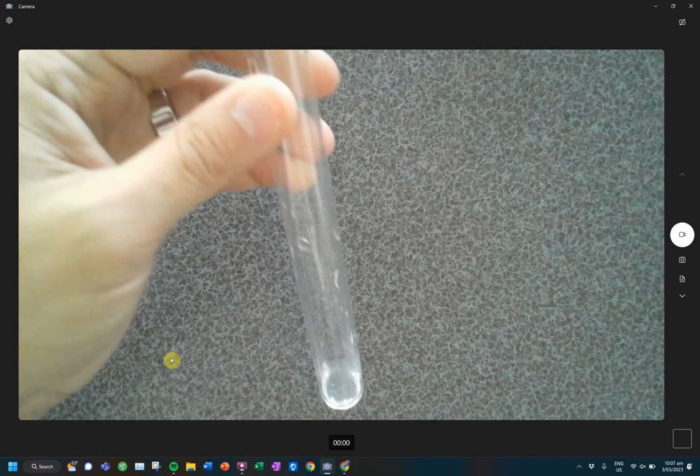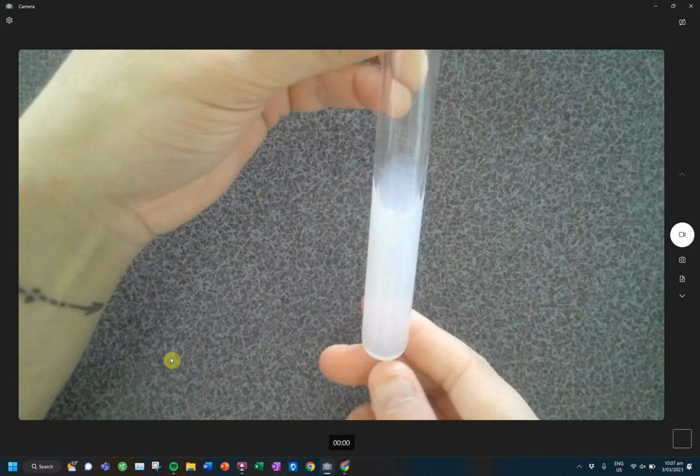And then what I would do is I would add excess of my ammonia. Oh, making it worse. Okay. You can actually see it a little better now. That opaque. All right, now I'm going to take some of that out because I want to make sure that if it is zinc, will it dissolve if I have the ratios right? So again, we're always playing with our ratios to make sure.